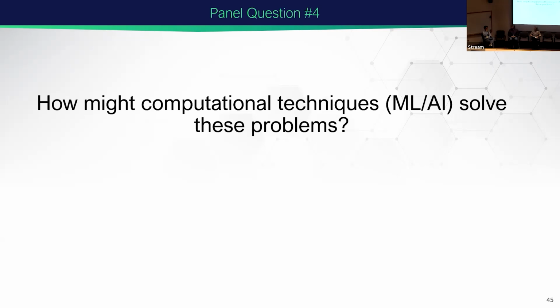So that's one problem. Some people are trying different ways of normalization instead of throwing in raw signals. Some people try logarithmic scaled data and then do it. But then there is another problem: how do you differentiate from noise and so on? So there are a lot of problems. That's definitely something data scientists can jump in on and find the solution.